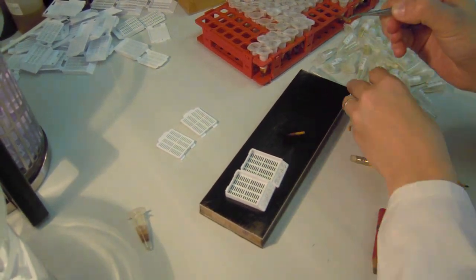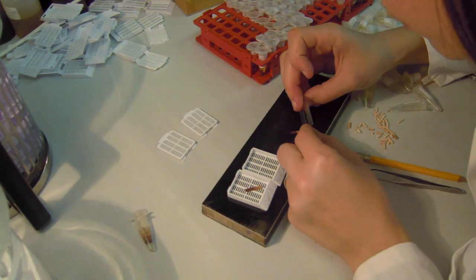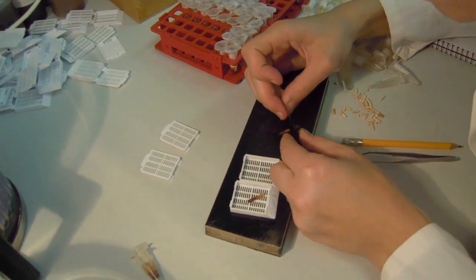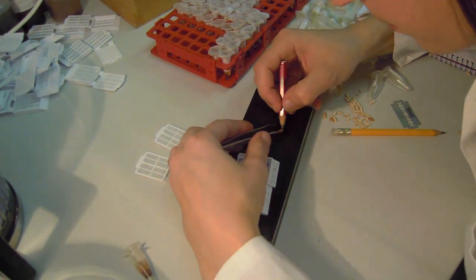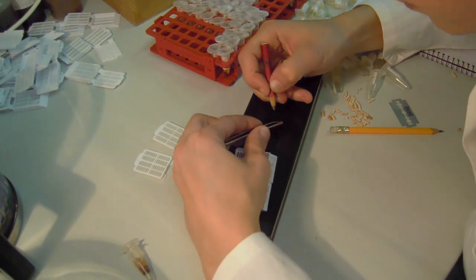First, the excess bark and xylem growth rings are removed with the razor blade. The sample should however contain at least the two youngest xylem growth rings and the youngest part of phloem. Then, the transverse plane of the microcore is identified and marked with the pencil.